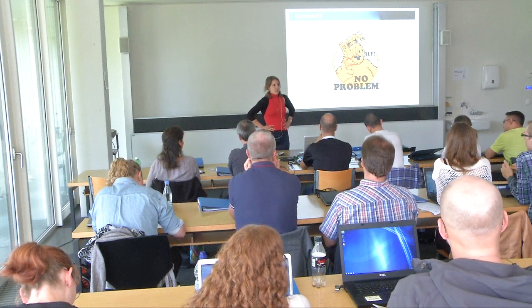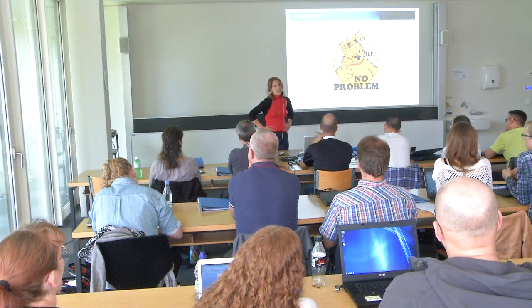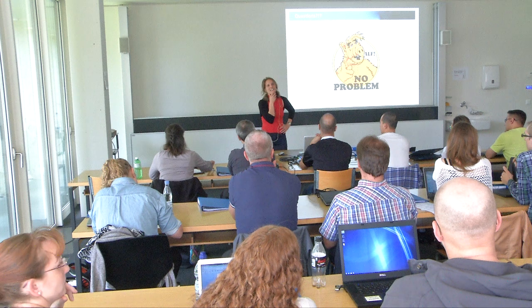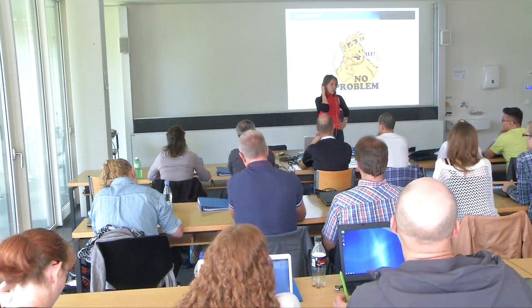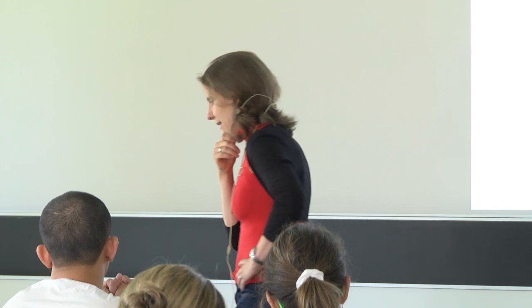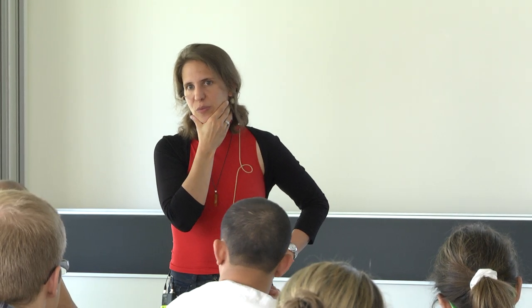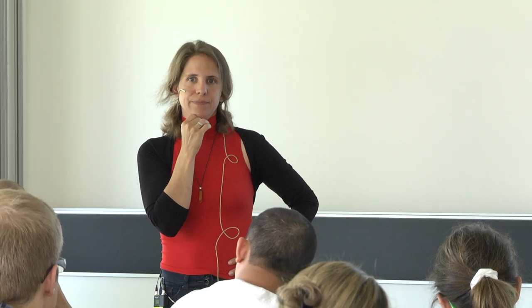As early as possible. I spike it in usually even before digestion. Shall I repeat the question? Okay, so the question is, what's the best time point to spike in a peptide reference, right? A protein reference, by the way, you would anyway spike in before. And I always say the best time point is to spike it in as early as possible. So I spike it in even before digestion.